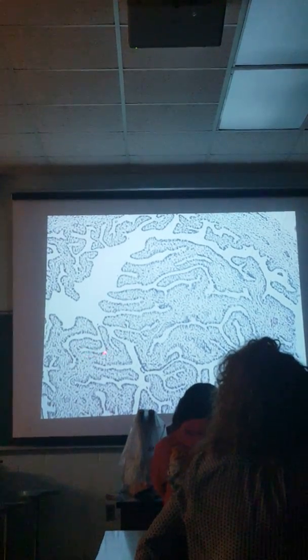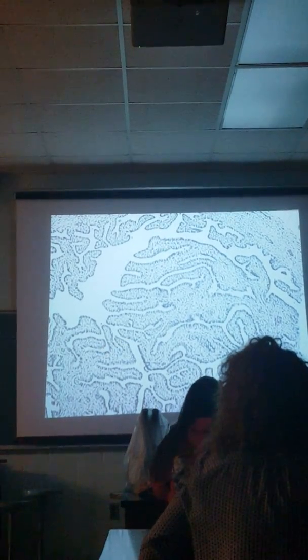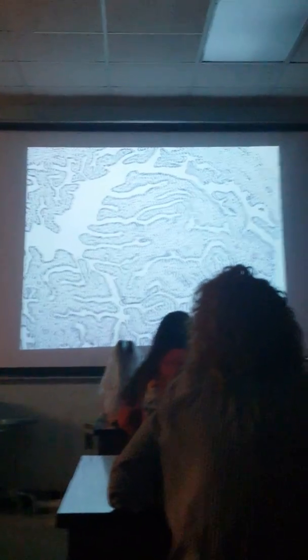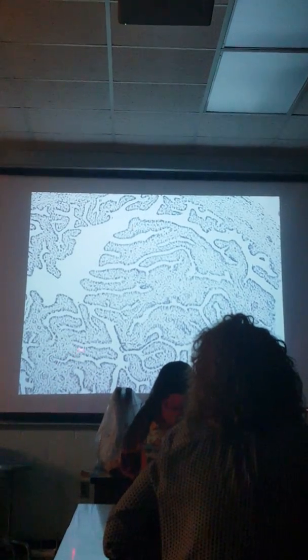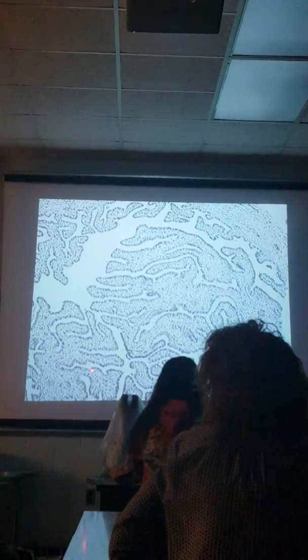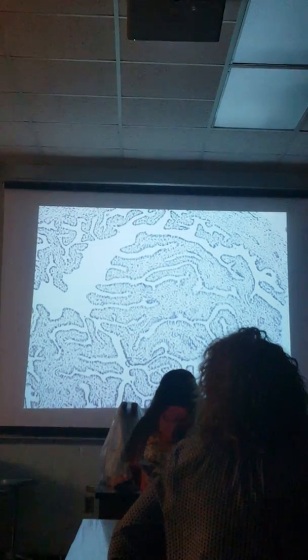Occasionally you'll see a chunk. These are like PEG cells, PEG. PEG cells secrete nutrients that help keep the egg happy, and these nutrients also help keep the sperm happy. Sperm cells can survive a few days, maybe even a week, in the ampulla, nice and happy.